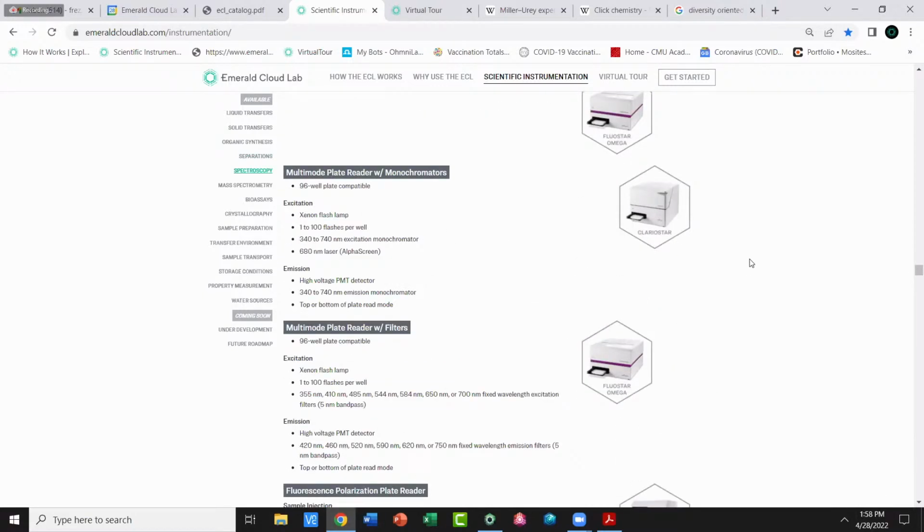That's why I think if we set you up with model systems, like, Catherine, I'm thinking about the toehold-mediated strand displacement reaction with the dual dye, so you can see binding and displacement as two separate steps. If we do the ugliness of synthesis and QC of that up front, Stephen doesn't have to worry about that, it's just making sure the compounds are pure. We have exactly the thing we want to play with, and then show you how to run the actual reactions so you can monitor them and see the kinetics coming out. That'd be great.